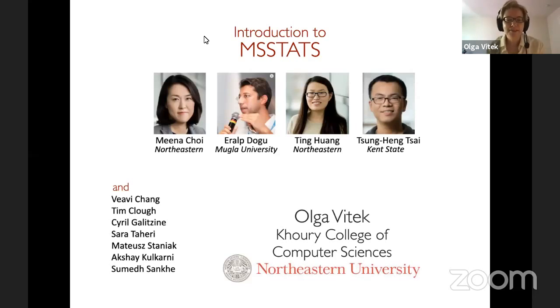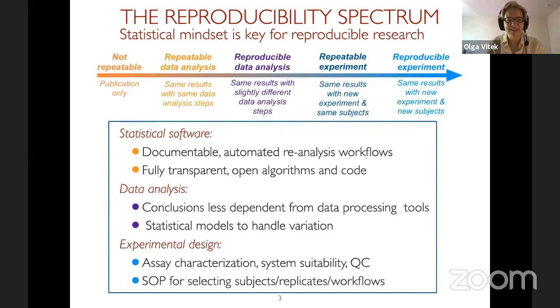MSstats is a project which now exists for 14 years or so. So it's been already quite a while. And so I would really like to acknowledge first the main contributors to MSstats. Meena Choi, who is the leader of the project. And we have very substantial contributions from Eralp, Ting, and Tsungheng. And also we have a whole group of former and current group members who are also active contributors. And their work is very important for us.